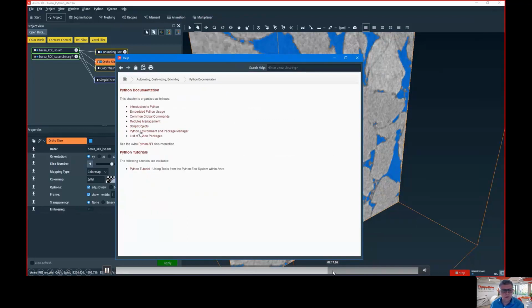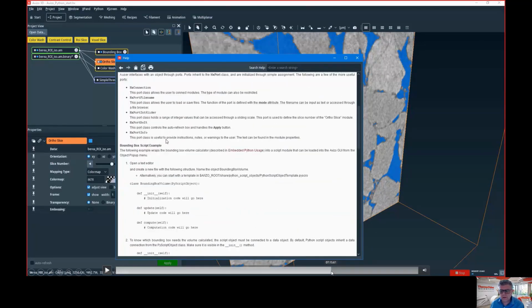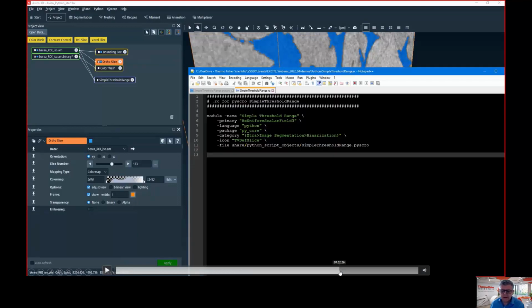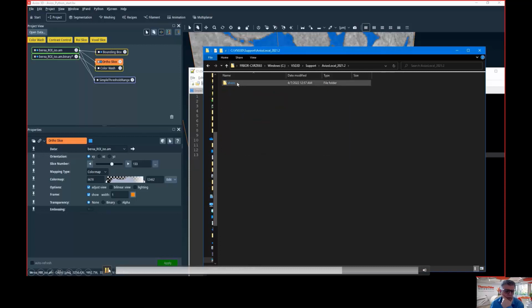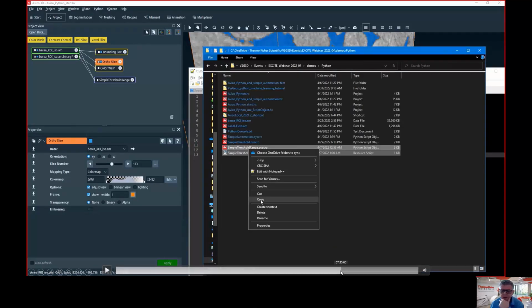Yeah, so I think I did exactly the same thing. So we can jump. Then the last final step, a little bit tricky. I have to copy this in another directory because otherwise Avizo will not do it. So I copy. Where do I put it? I put it in a directory that is called Avizo local. What is this Avizo local? It's a directory that you can create yourself. It's empty by default, you create an empty directory, and then you have to put some structure in it.